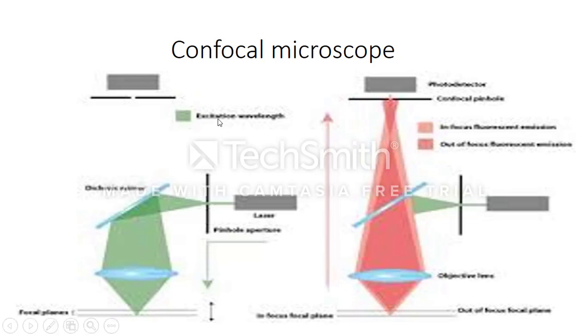So the simple benefit to the confocal microscope is that you can look at cells when they're alive. And what we use to look at cells when they're alive is a different sort of fluorescence. In the case before, we used fluorochromes that we could simply attach to proteins. In this case, we use fluorescent protein, GFP, and these are extracted from jellyfish.